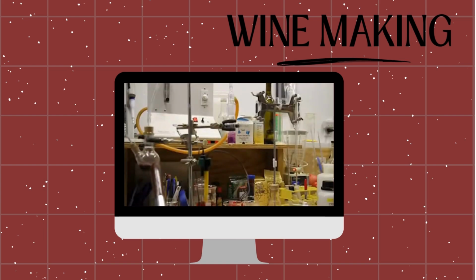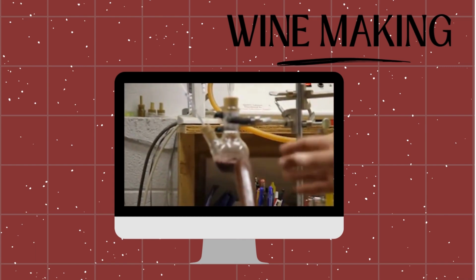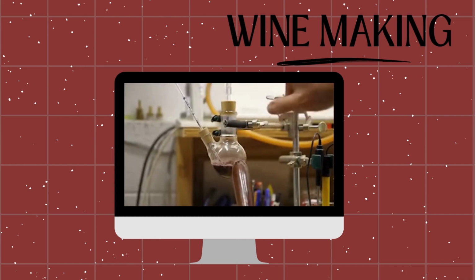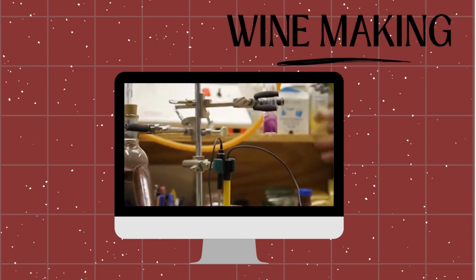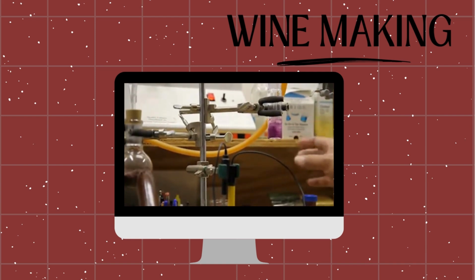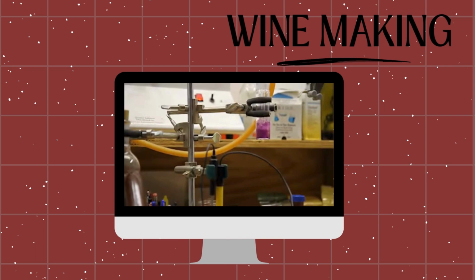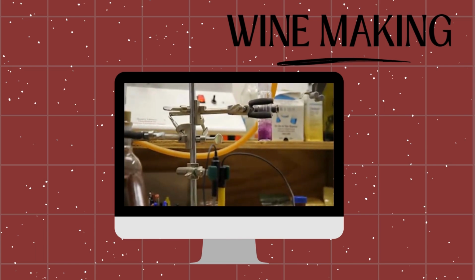What is it doing? What it's doing is it's aspirating. This is acidified wine. So we have wine in here, and we have phosphoric acid to acidify it. And I'm aspirating air bubbles through it, which draws the sulfur dioxide gas out of the wine, runs it through the hydrogen peroxide. World's fastest chemical reaction. Hydrogen peroxide and sulfur dioxide yield sulfuric acid. Bang. So it changes from green, gray to purple. So now we know we have sulfur dioxide in here, and after 10 minutes, all of it should be aspirated out of here. And then I titrate it out with sodium hydroxide solution to determine how many parts per million of sulfur dioxide we have.